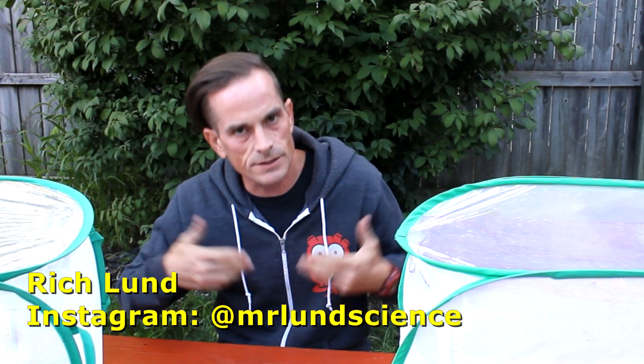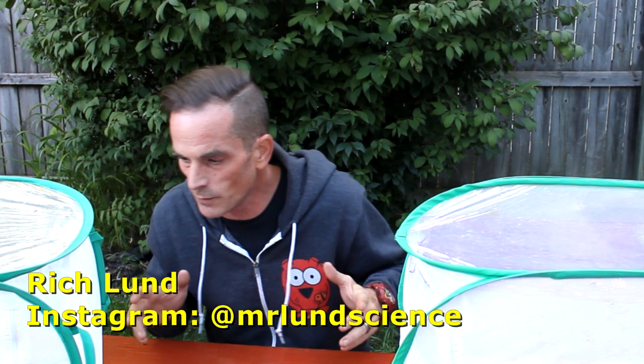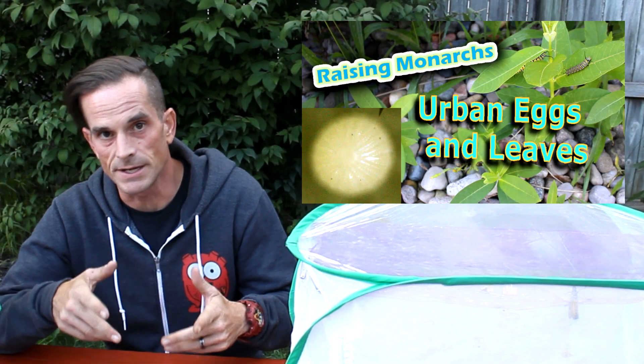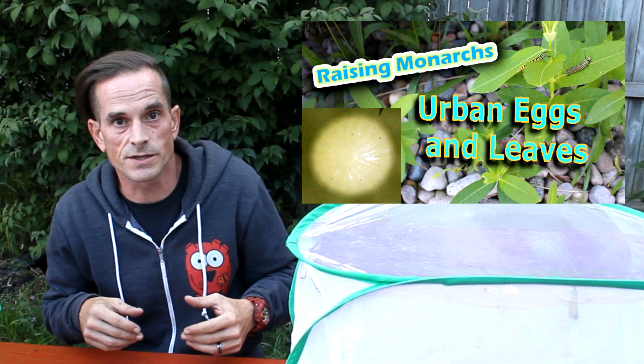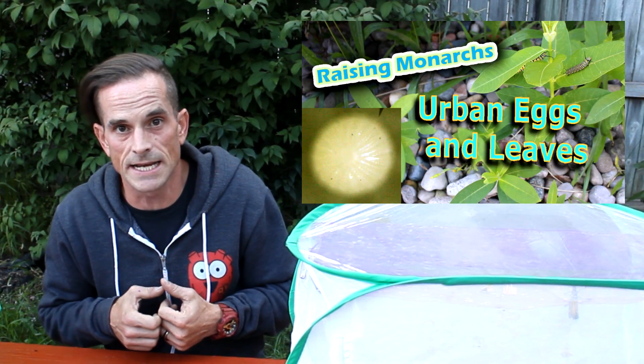Hi, I'm Rich Lund, just a guy trying to help some monarchs stay parasite-free, and I have here with me some special monarch guests. In the recent Urban Eggs and Leaves video, I chance-examined an egg that had been collected while sourced. I looked at it under the microscope, which was something I hadn't really done since relocating to my new location. Honestly, I was trying to get a good thumbnail for that video when I happened upon finding what appeared to be OE spores on that egg.